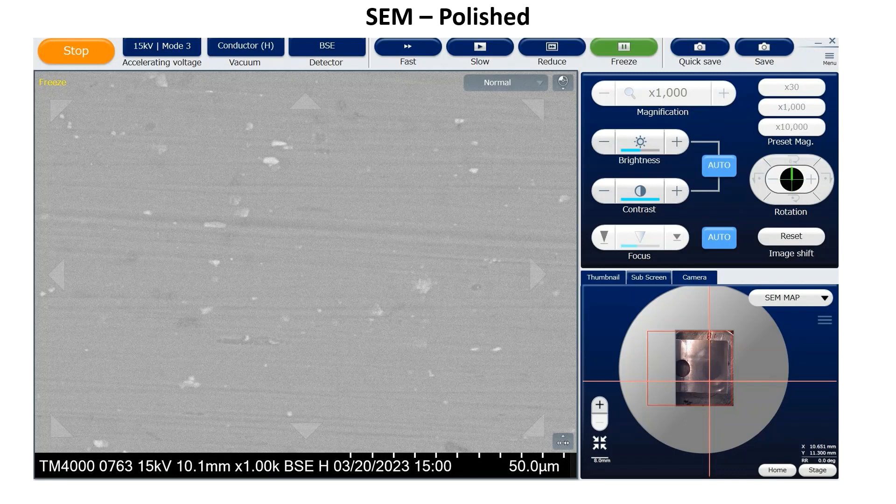This is the surface that I polished at a thousand times magnification. After the fine machining I sanded from 400 to 2000 grit, then polished it with a buffing wheel and polishing compound. There are still some machining marks left in the middle of the polished area, but this was an image in an area that looked close to a mirror finish. It is interesting to me that sanding lines are still visible. I'm guessing the small brighter specks are small chunks of aluminum or polishing compound that have become embedded in the surface. Prior to imaging this, all I did was rinse the part with isopropanol and wipe it off with a soft cotton cloth.